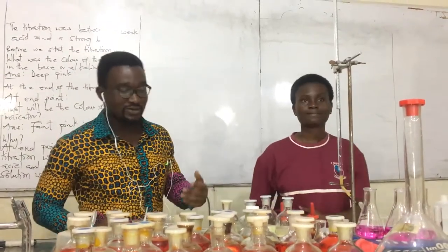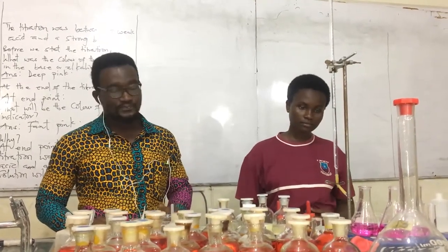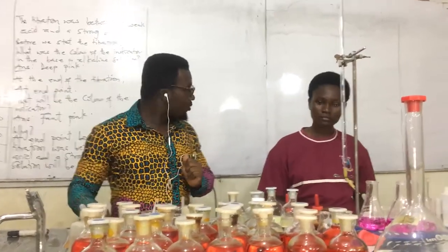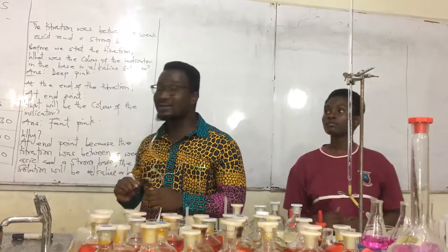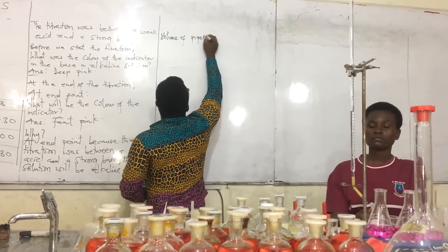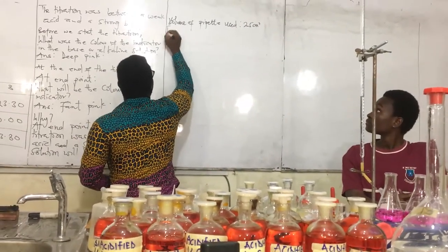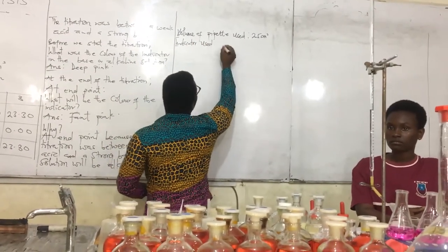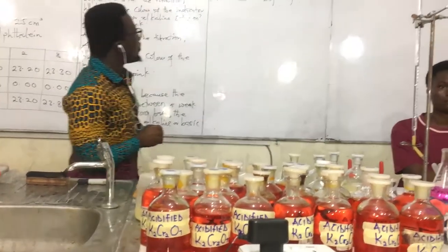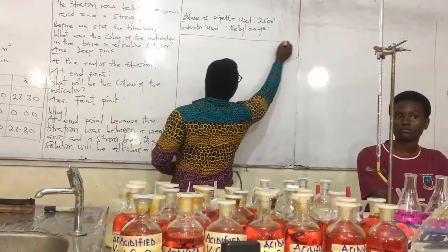Consistency. She's going to announce her values to you, the volume she ran. First value, second value, third value, consistency. In everything, she made sure that she started from the zero mark. Now, we'll go through the simple table once again. Indicator used, you will discuss the color change later. So I'm going to draw this.